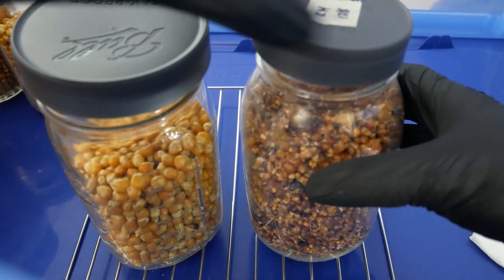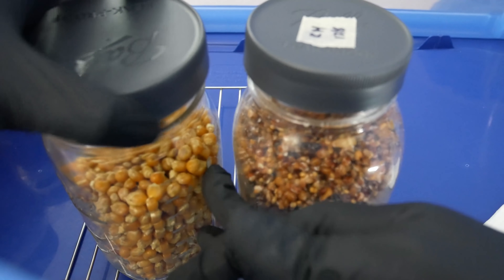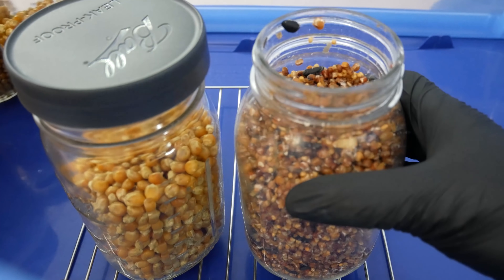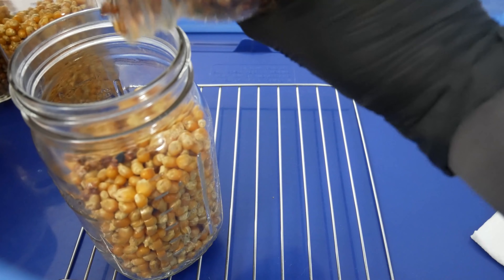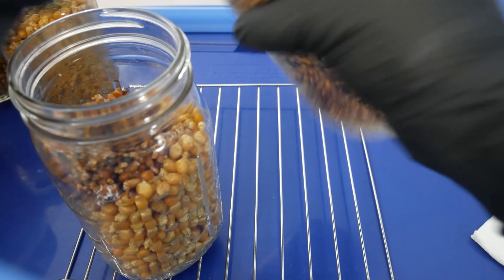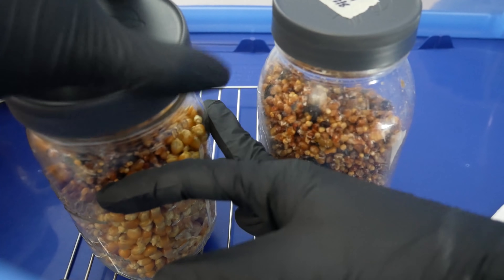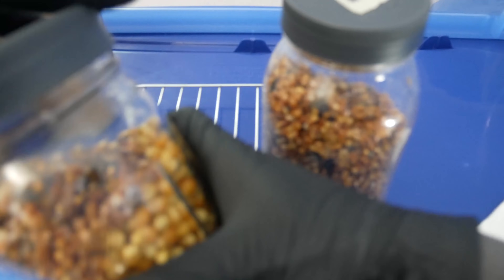A question that comes up all the time: can you use different types of grains for grain-to-grain? The answer is yes — you can go from one type of grain to any other. Today I'm using wild bird seeds and transferring them over to sterilized popcorn grain. It really doesn't matter as long as it's done in a clean and sterile environment; the process is always the same.